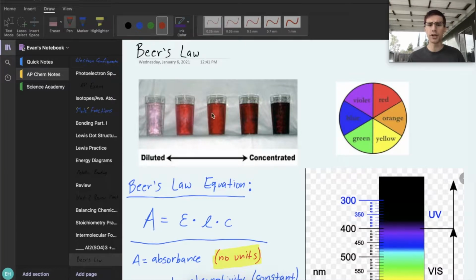So it's helpful in chemistry if you're looking at 2 different solutions and you can't tell which one's more concentrated, or if you're looking at a solution of an unknown concentration and you're thinking, how in the world can I figure out what the concentration of this solution is if I don't know how much stuff was added to it? Well, let's dive into that in a minute.